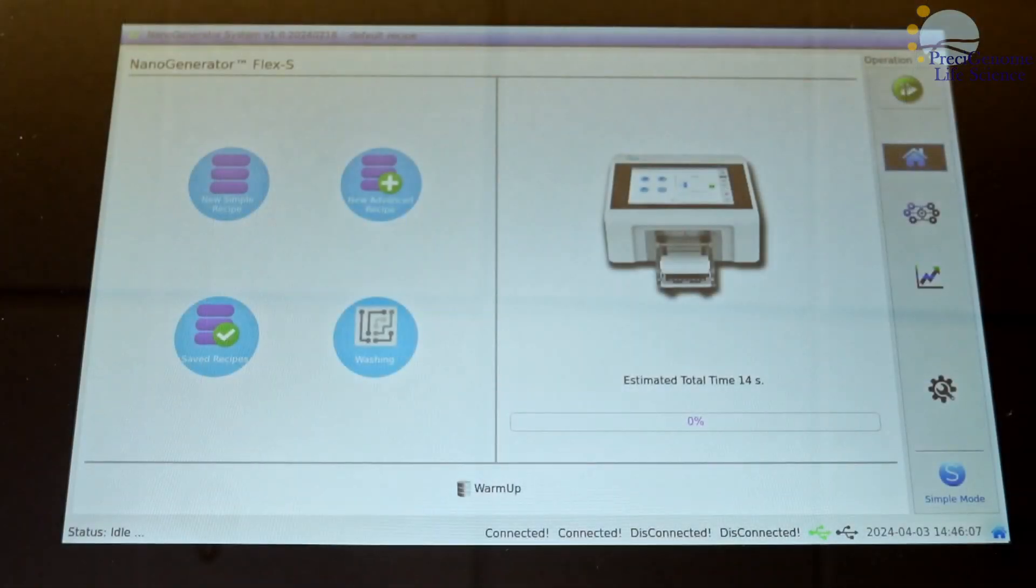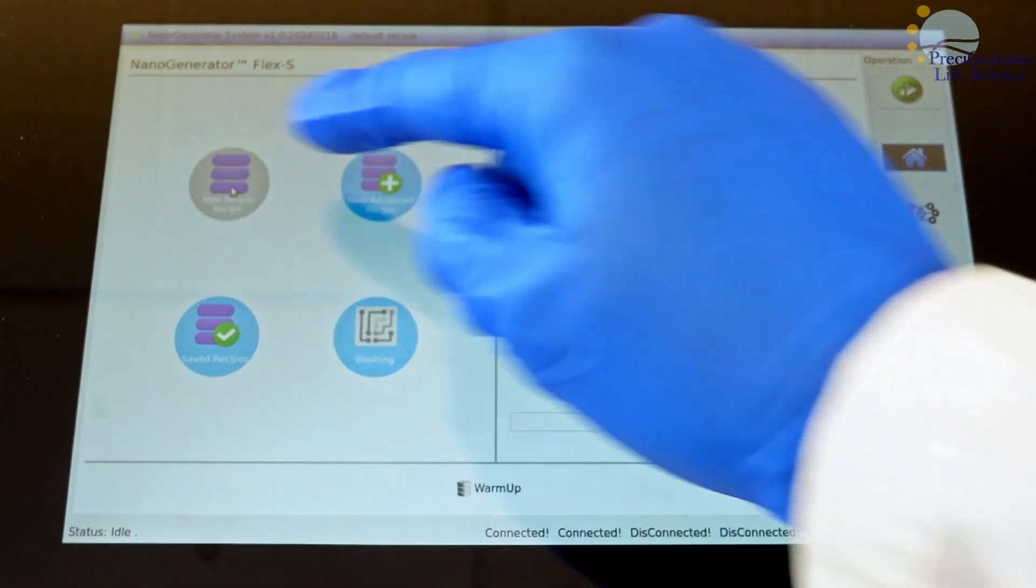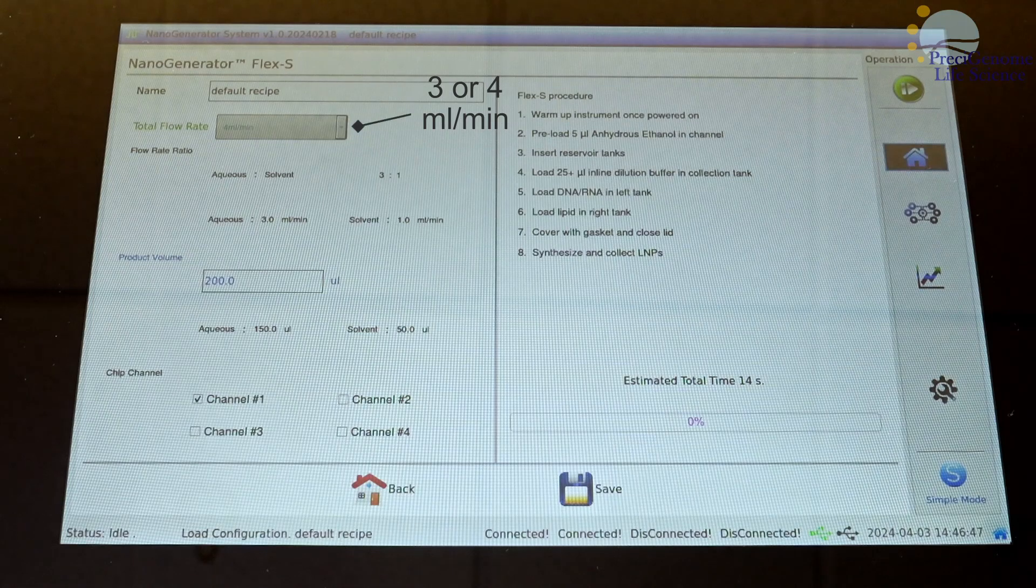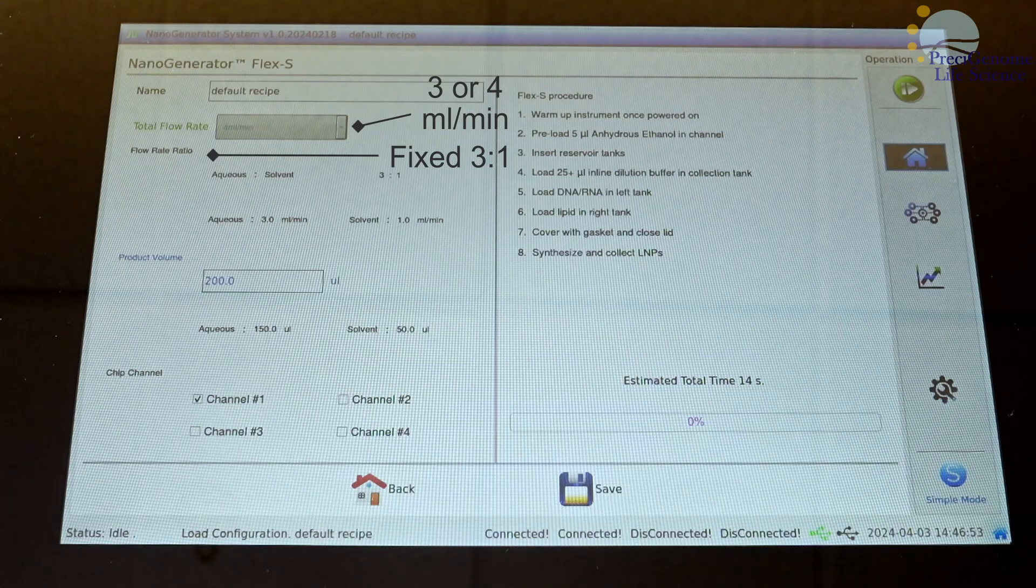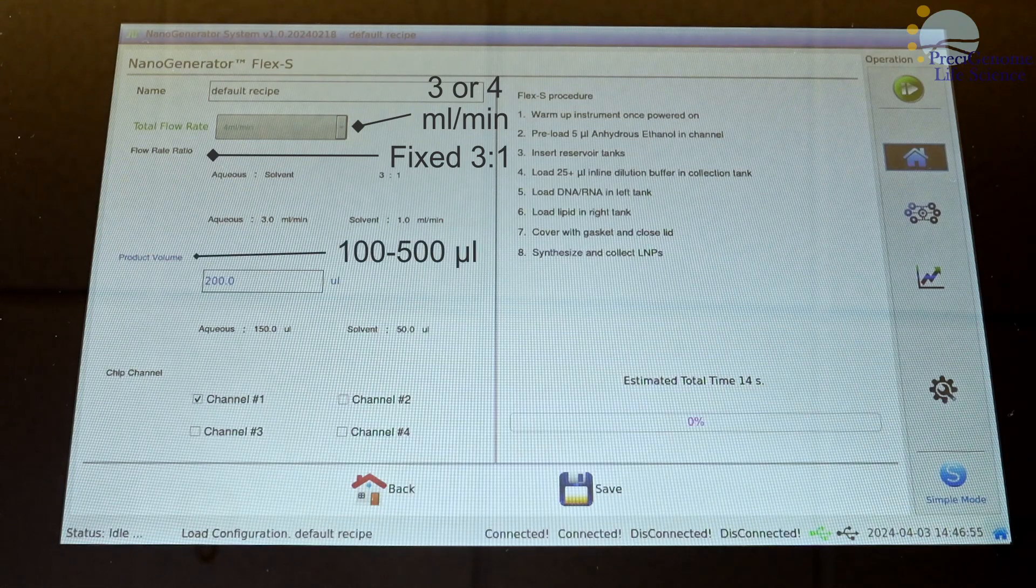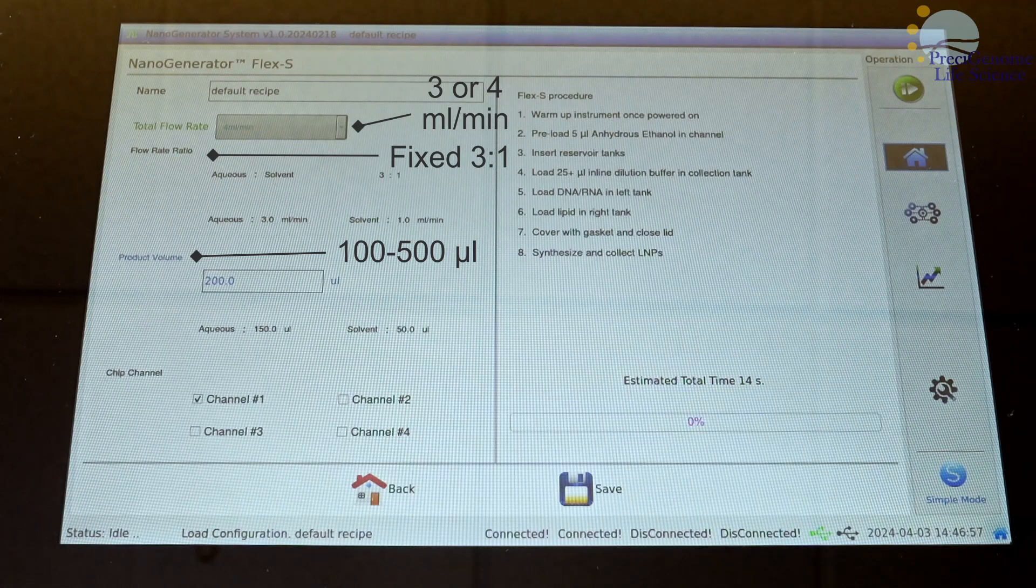The FlexS software has streamlined parameters for rapid screening. The total flow rate may be set to 3 or 4 mils per minute, while flow rate ratio is fixed at 3 to 1. The total volume may be set from 100 to 500 microliters.